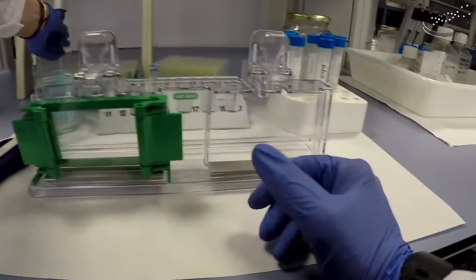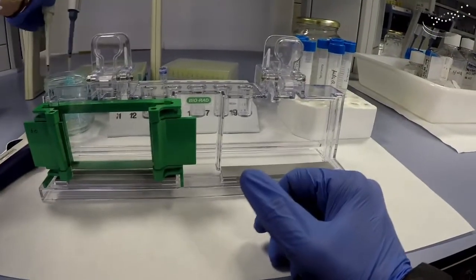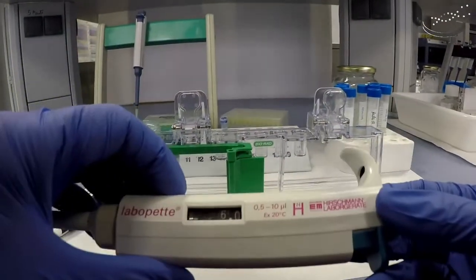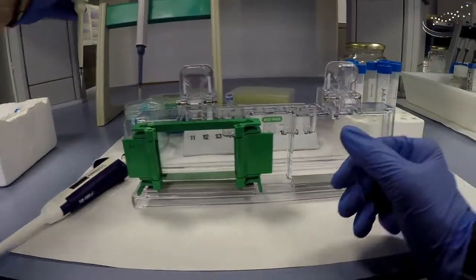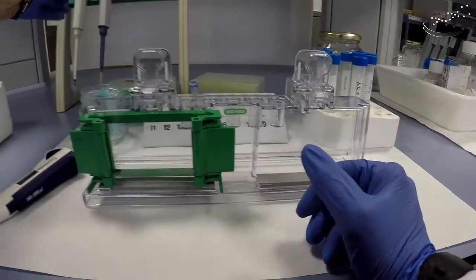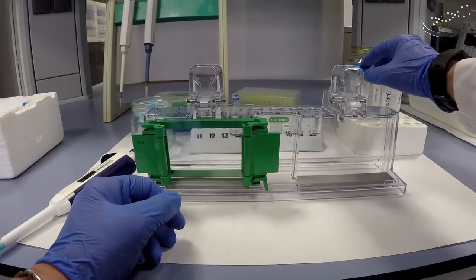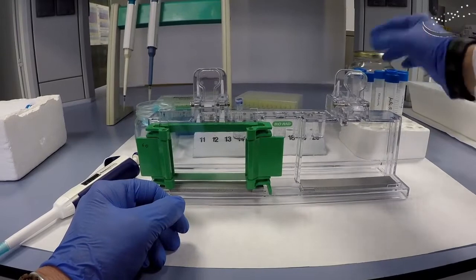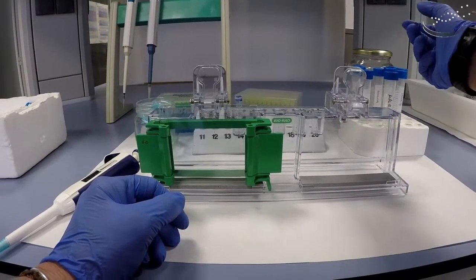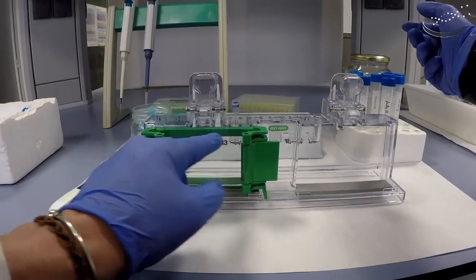To get everything prepared, we have one pipette set at 1 milliliter, another pipette set at 60 microliters, which is the amount of APS we have to add, and another one set at 6 microliters, which is the amount of TEMED we have to add. We want to have everything prepared because time is of the essence — once we add the APS and the TEMED, the gel will start to polymerize, so we need to work quickly.